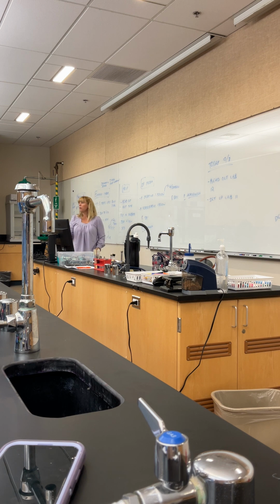So this is where I added oil to the media. Which one of my organisms was able to turn yellow when there was no oxygen present? E. coli. And again, hopefully it makes sense, right? What kind of environment does E. coli prefer? He's a facultative anaerobe. So he likes oxygen better. When oxygen's present, he can get 38 ATP. But if I take oxygen away, he can make it. All right? He's a facultative anaerobe. He can live on those 2 ATP. We'll figure it out. Just have a little cookie.